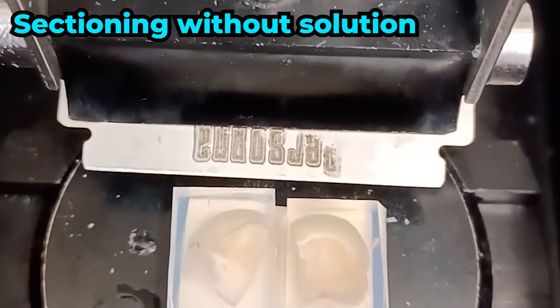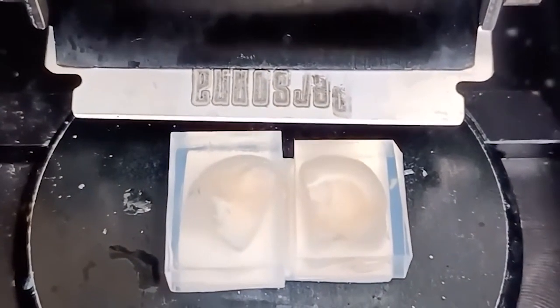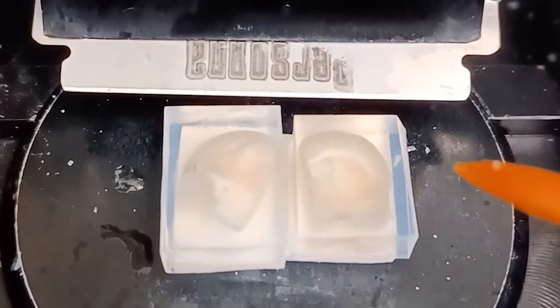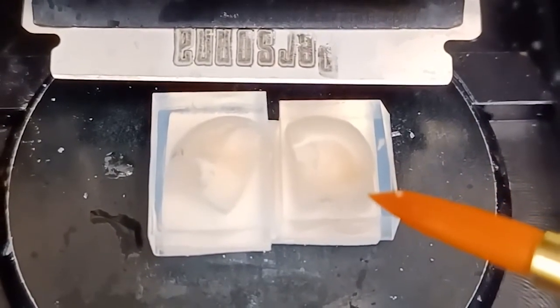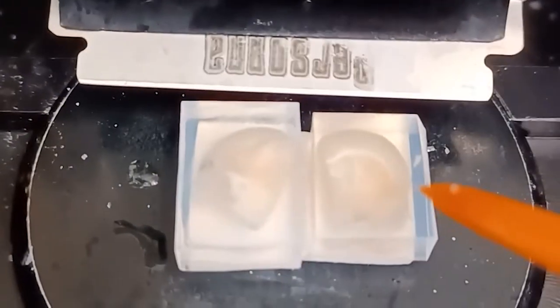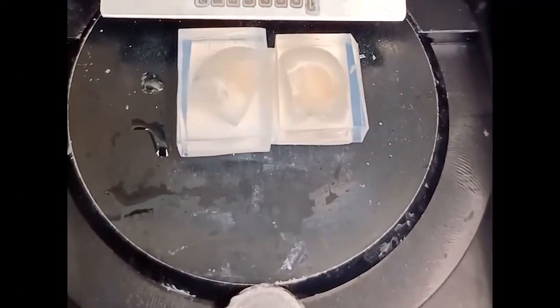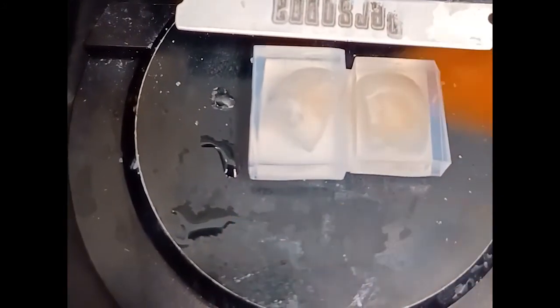One helpful thing: the agarose, if submerged in solution in the basin, can actually swell depending on the salinity, which can vary if you add water or PBS. That swelling seems to cause the alternating thick-thin section problem. Cutting not submerged has worked pretty well for me. Ideally, you want to let the blade go a little farther past where the agarose ends, so you have time to bring your brush in and swipe off the separate sections to put them into separate wells.